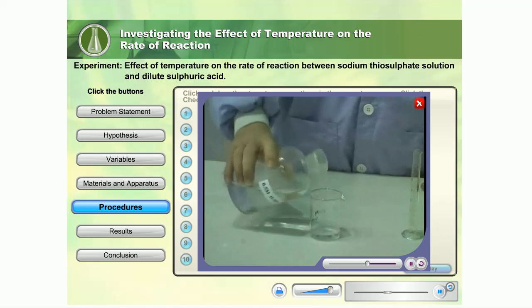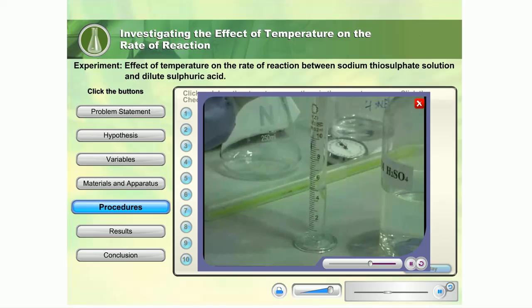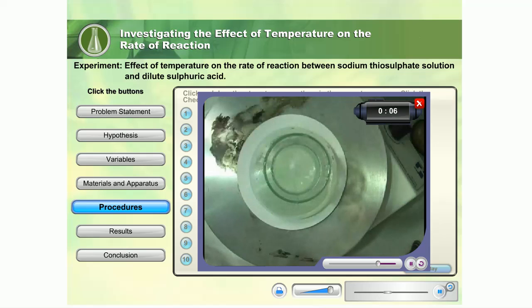Measure 5 cm³ of 0.5 mol per cubic decimeter of sulfuric acid. Pour the sulfuric acid into the sodium thiosulfate solution at one go. Start the stopwatch and magnetic stirrer immediately.